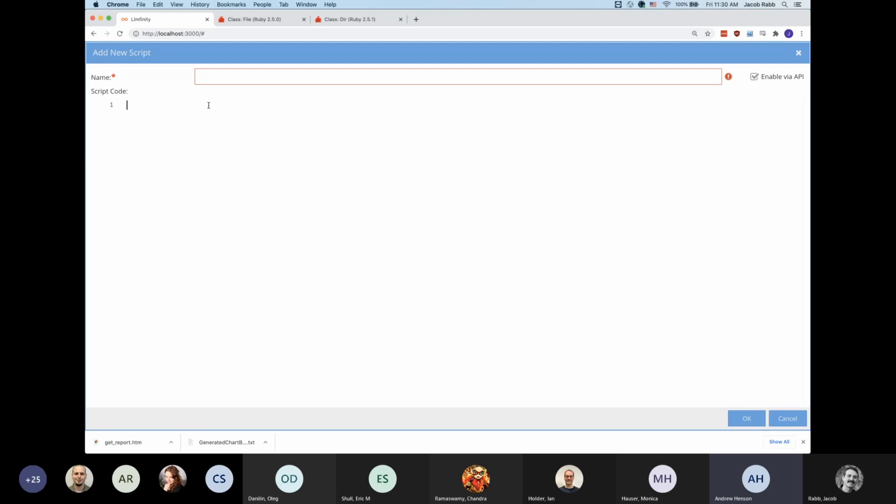Okay. Oh, that's brilliant. Is there a sandbox environment that I can tinker with, or would I need to speak to Richard to get one? Because we've got live, we've got UAT and development, but nothing where I can just go and have a play. Sure. I think that would be best as a question for Richard as well.